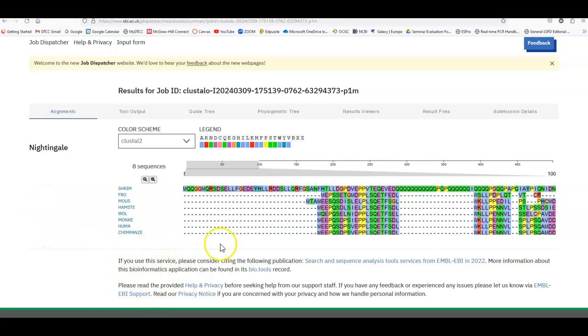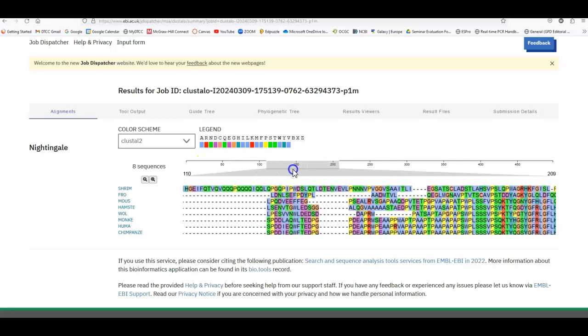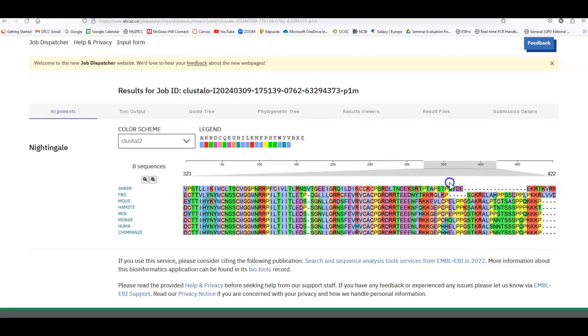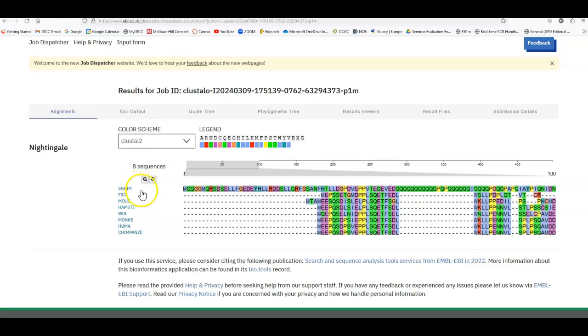And so we can see here what we have. Again, you can see how everything in this course builds off of what you learned before. So now we have a multiple alignment with different amino acids, and this is the chart indicator of what they are. And I can take this little bar here and just scroll along the whole thing. And we can already see that there's areas of similarity that a lot of these have, and there's definitely areas of distance. If you take a look at shrimp, that is definitely a bit different than all the rest. And you can see it still starts with methionine.